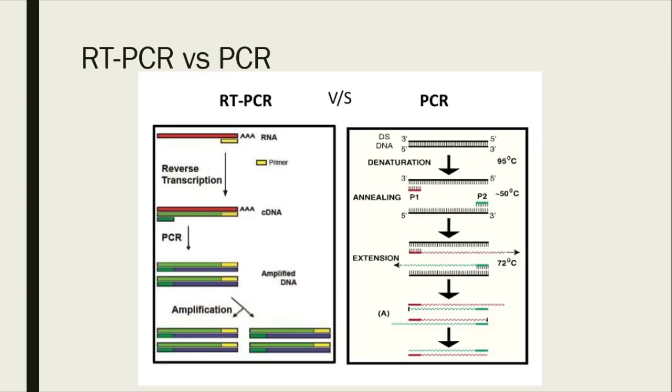Now, what is RT-PCR? It's just one step before the real PCR, the so-called reverse transcription step. You start with viral RNA, and you have a primer to make a cDNA, a copy of the DNA, so that now you have the first cDNA. After this reverse transcription step, you go back to the regular PCR. Basically, you have a DNA starting material, and then you amplify and amplify and amplify, just like your regular PCR. Like I said, there's only this small difference at the beginning.